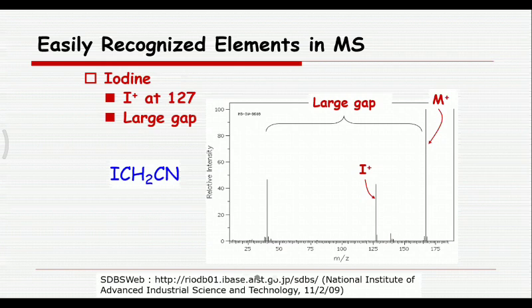Okay. The last example we'll study with regard to isotopes, or when we talk about the halogens particularly. This is an interesting spectrum, and it can easily be understood. If a compound contains iodine, with a huge atomic weight of 127, it readily undergoes fragmentation, and the fragment formed gives a large gap between your molecular ion peak and the other fragment peak.